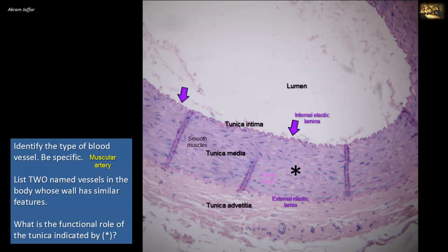As for the second part of the question, most of the named arteries in the body are muscular arteries, such as brachial artery, radial, ulnar, femoral, popliteal, tibial, to name but a few.